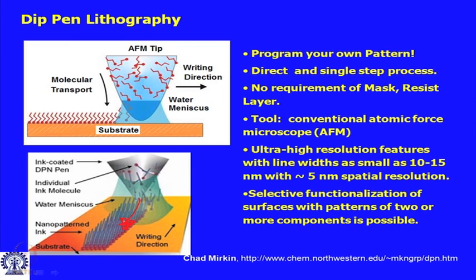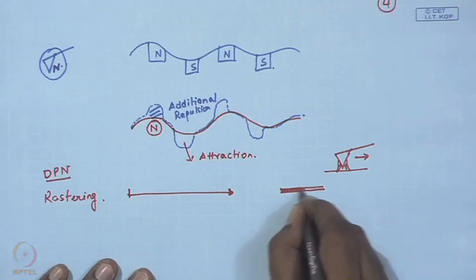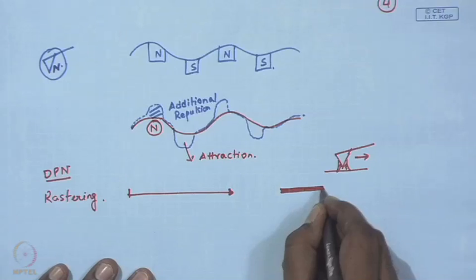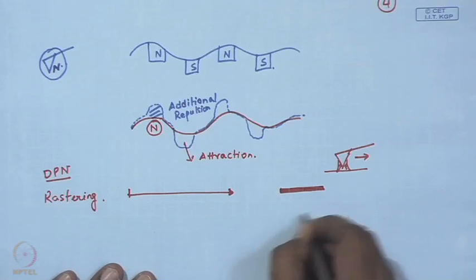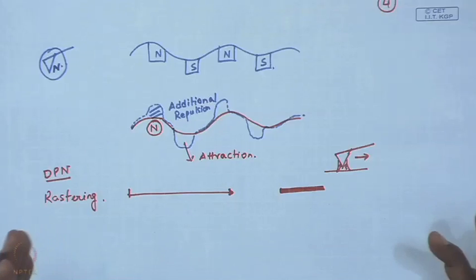And you know, we have discussed while talking about microcontact printing, these SAM molecules, depending on the ligands X and Y, orient and bind to the surface. So, in a way, every scan will result in very tiny but very uniform domains of SAM molecules, and the zones over which the cantilever has not scanned, there will be no deposition.